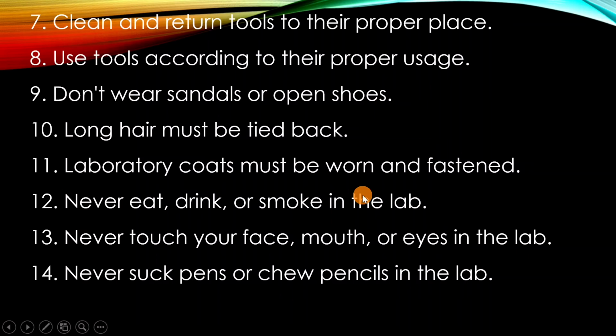If anyone has long hair, the hair must be tied back, because the hair can act as a distractor. Then also laboratory coats must be worn and fastened. If they have buttons, someone must fasten the buttons so that they are protected fully. Any spillage will reach the laboratory coat, because those are acid proof. They are made of a material which is acid proof.